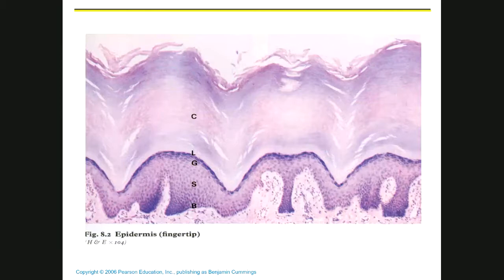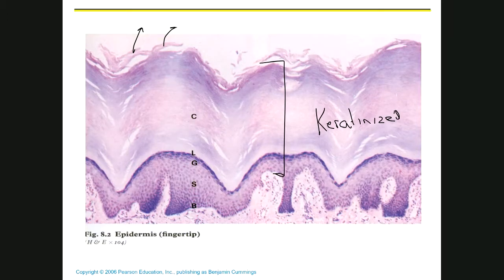So, what do you think this is? Is it keratinized or non-keratinized? Here's the tissue from here to here. What do you think it is? Anybody want to guess? You can see the sloughing off right here. That's where the sloughing off happens. Yeah, Edenia says keratinized, and that's exactly right. And you can even tell exactly where the keratin starts. It starts right here. That's where it starts. Look, there's nuclei down here, but not one nucleus above it.